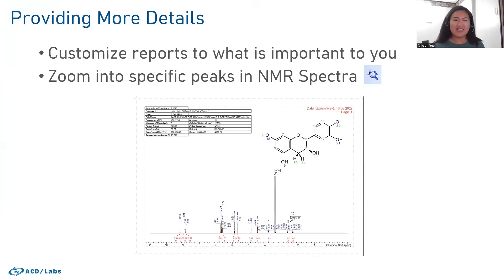Like many other things in ChemSketch, as you may have noticed, even our reports are highly customizable. One of the features we find so many people really like is the ability to actually zoom in to specific peaks and areas within their NMR spectrum. What you're getting is really high-quality zoom-ins and really valuable and useful information, and of course I'm going to show you this.